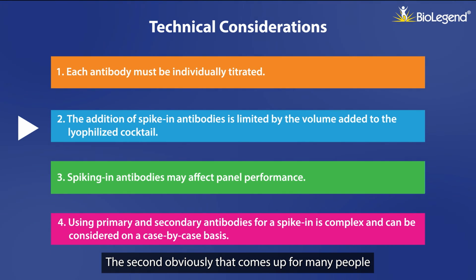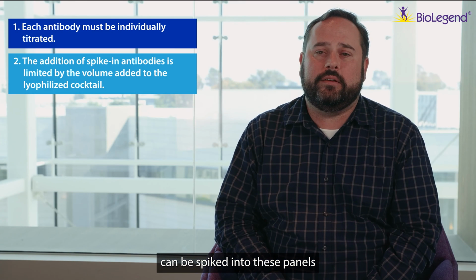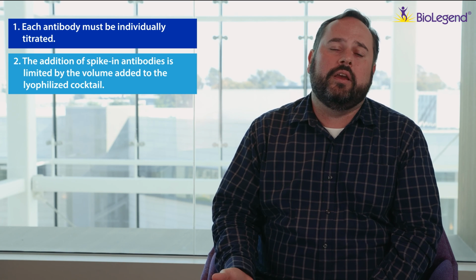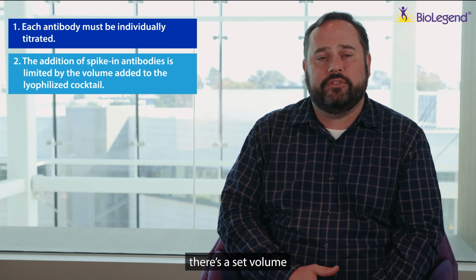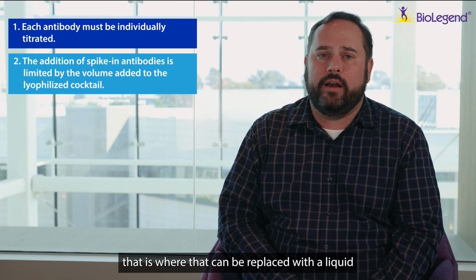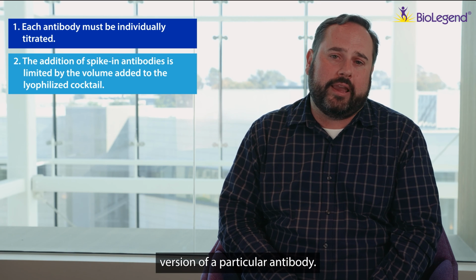The second, obviously, that comes up for many people is how many targets can we spike into these panels, and that really is the volume consideration. When these lyophilized cocktails are brought back up into a liquid solution, there's a set volume that's used in this process. That is where that can be replaced with a liquid version of a particular antibody.